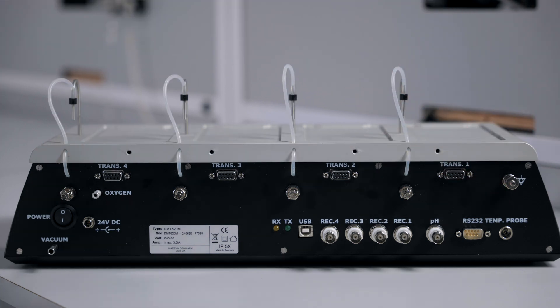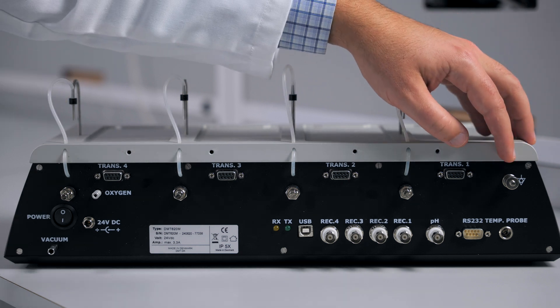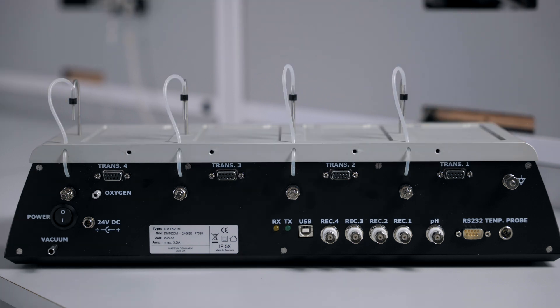There is a connection for a temperature probe to monitor the temperatures in your chambers. And finally, a ground connection to help eliminate any electrical noise.